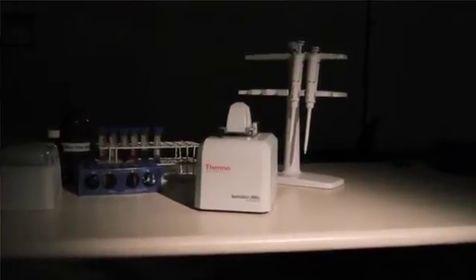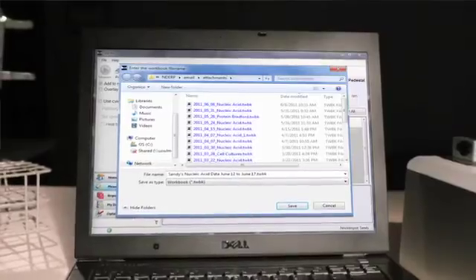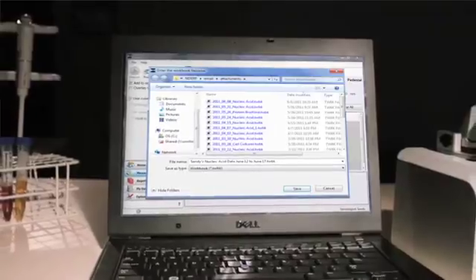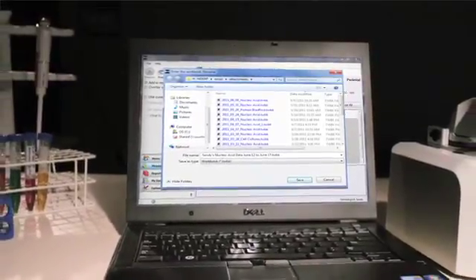Before the 2000, people did not have the ability to store their data in their own discrete workbook unless they set up a user account. But now each individual can have a workbook and it can transcend several days.